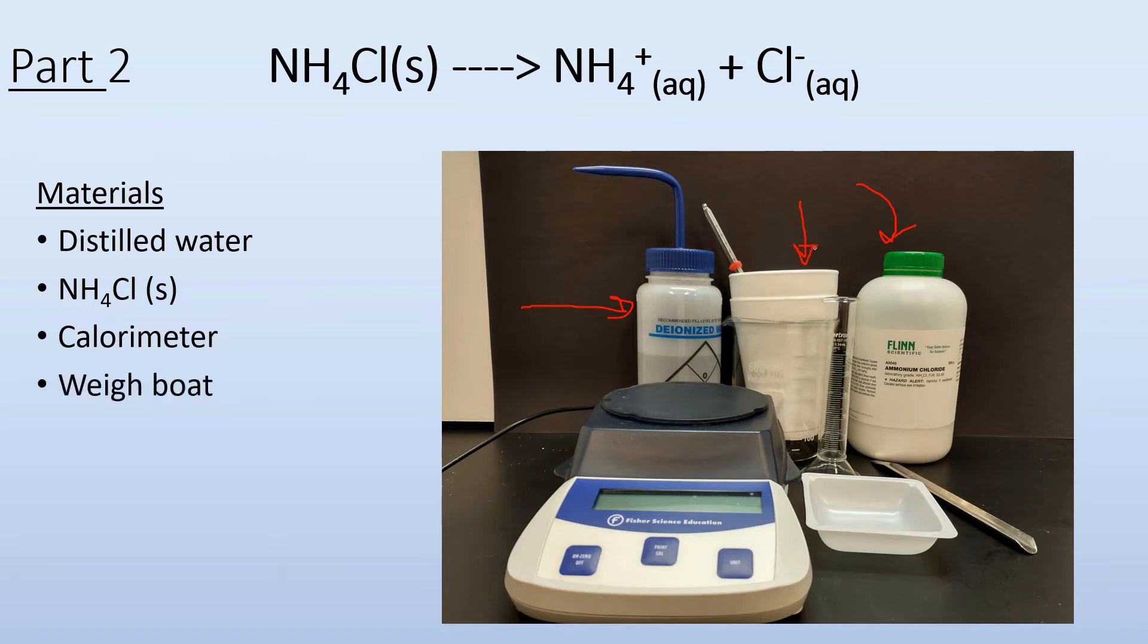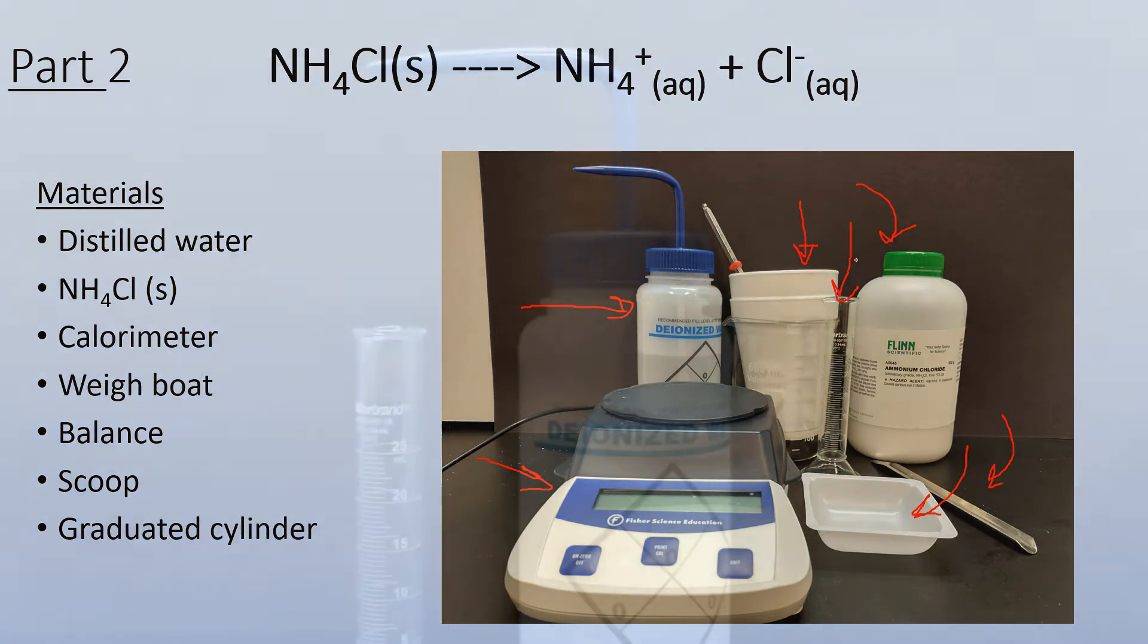A weigh boat so I can scoop out my ammonium chloride into something workable, a balance to measure out the specific mass of the ammonium chloride, and a scoop to scoop it out. And then I almost forgot, last but not least, the graduated cylinder so I can measure out a specific volume of water. So that's all I'm going to need for this part.